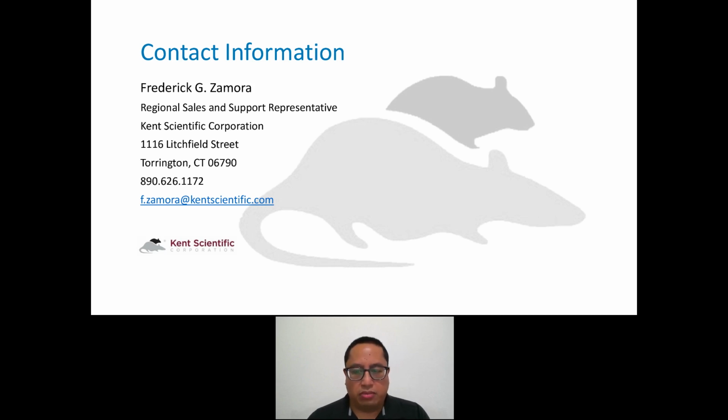What I've seen some labs do to minimize the amount of time it takes to remove the syringe and refill it is, if they know that they're going to be running low, they'll have a second glass syringe on standby, pre-filled with isoflurane. That way they can stop the system, remove the syringe, pop on the new one real fast, and then continue on.